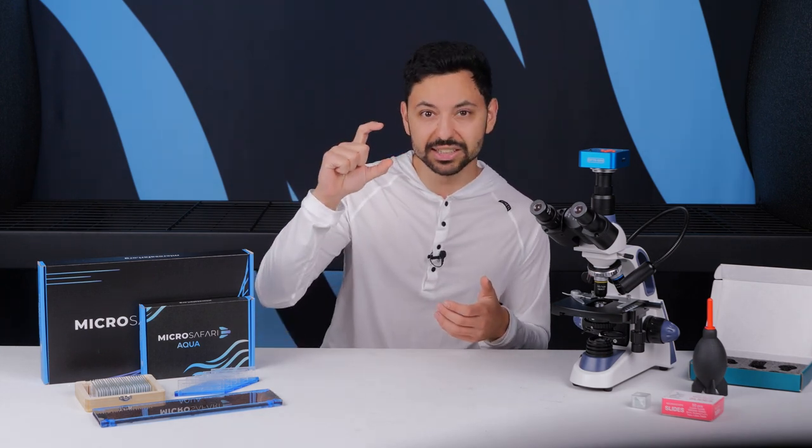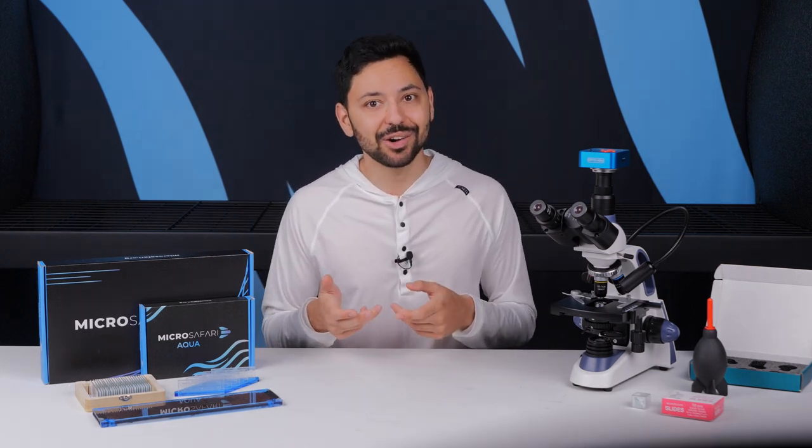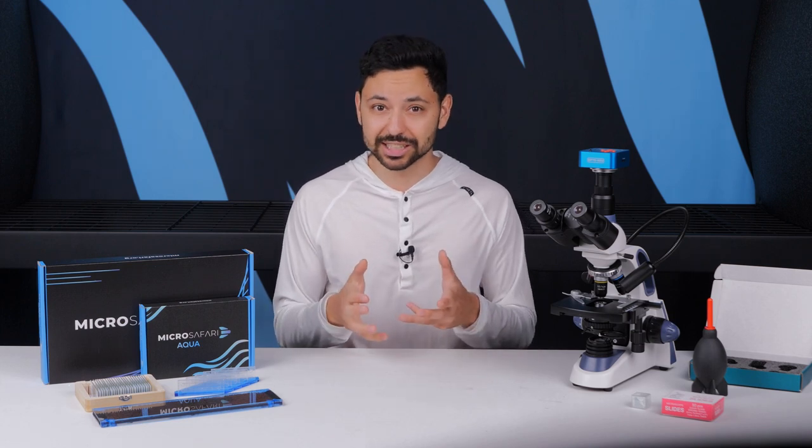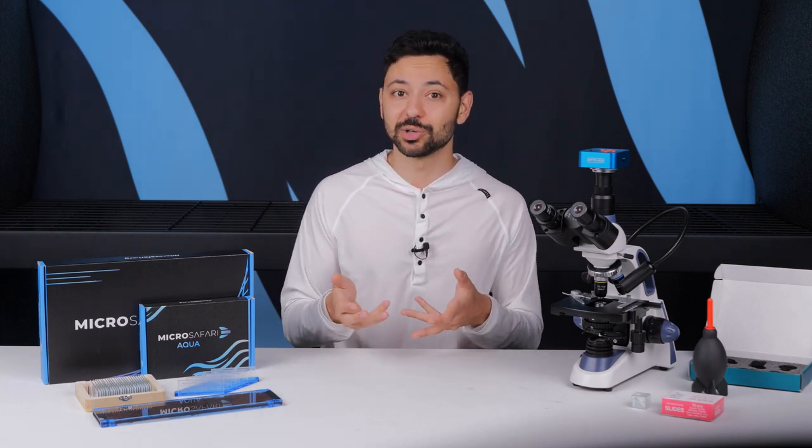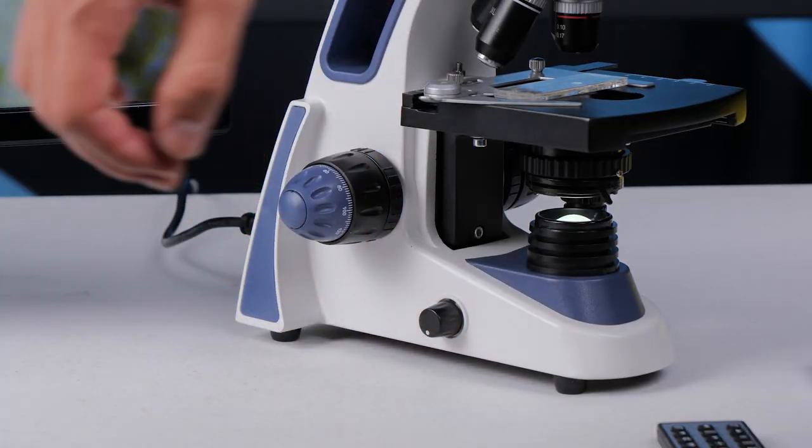You'll also note that changing the iris changes the brightness of the image, although you typically don't really want to use the condenser to change the brightness if possible. That job goes to the brightness adjustment knob located on the side of the microscope.